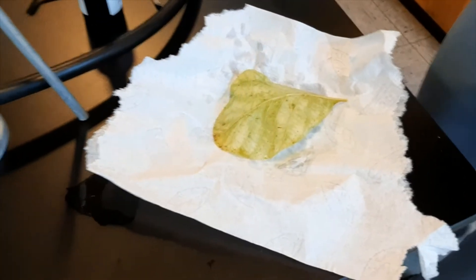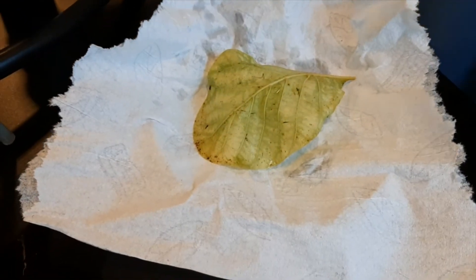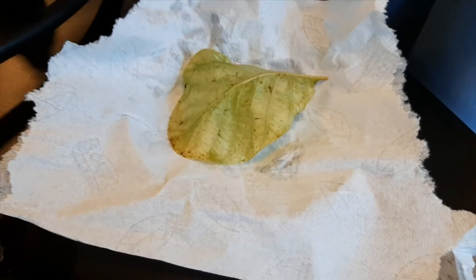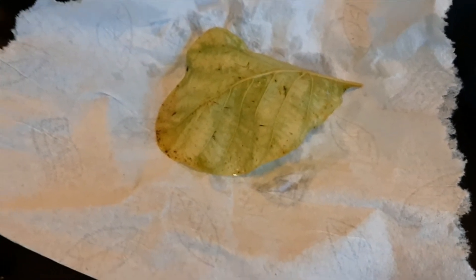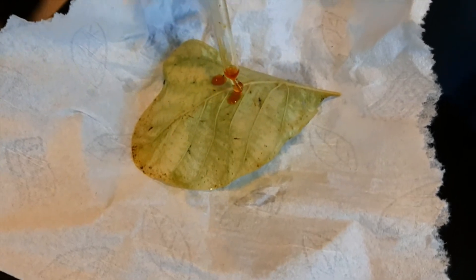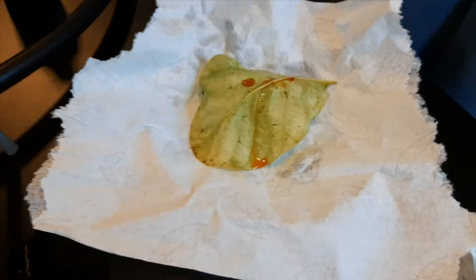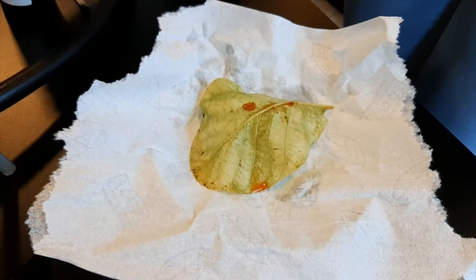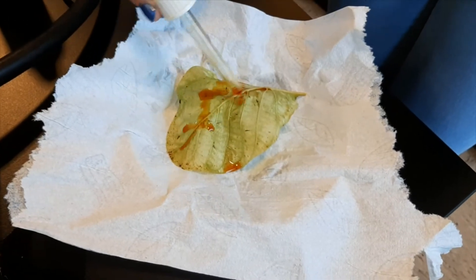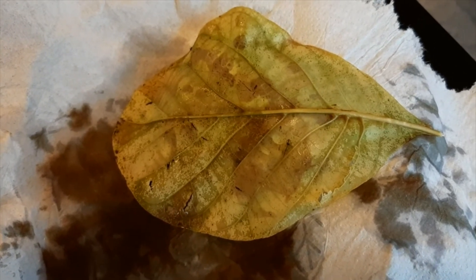Now our leaf has been boiled, watered, and alcohol-dried off. Now it's time to add the iodine solution. Put enough iodine solution on the leaf and leave it there for around two minutes. Here we are going to see the black spots — this is where we actually find the starch. Experiment successful.